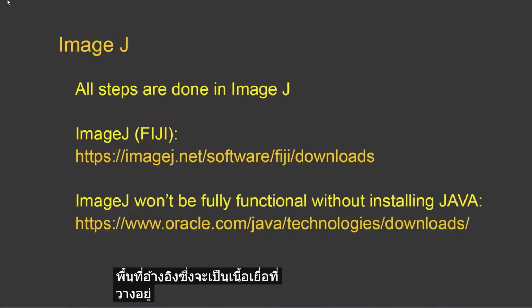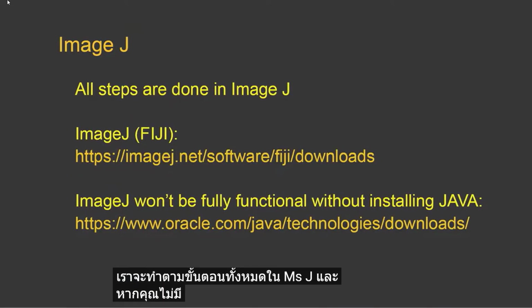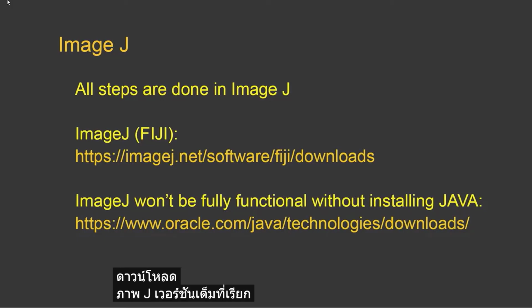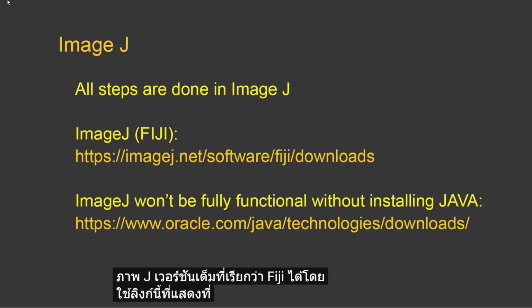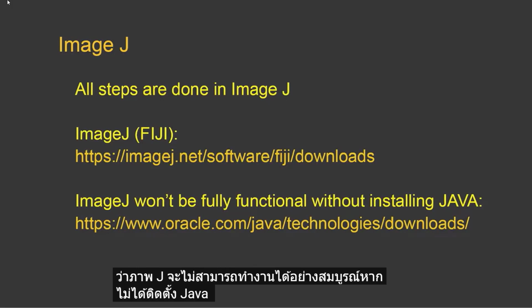We're going to do all steps in ImageJ, and if you don't have ImageJ, you can download a fully powered version of ImageJ called Fiji using this link shown here. And remember that ImageJ won't be fully functional without installing also Java.